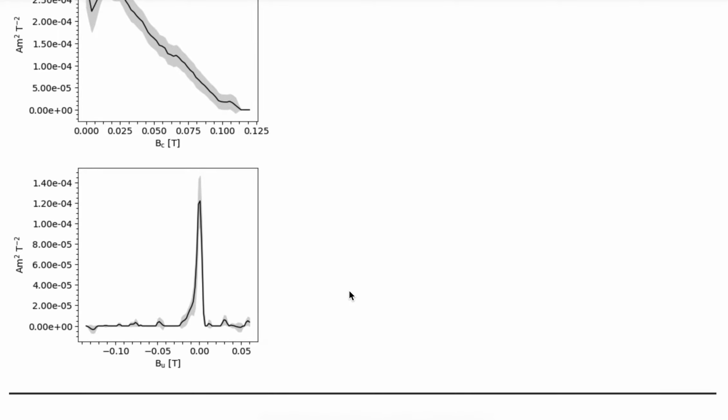Now, as I mentioned in one of the first tutorials, an important case here is that once you've completed processing of this sample, if you want to process a second sample, we would recommend that rather than going back to the top of this notebook and loading a new file, you shut down this notebook and start a new notebook to process the new sample. FORCsensei doesn't handle new samples very well if you try to write over the top of an existing notebook. So simply shut down this notebook, start the notebook again, and then you can start processing your new sample.